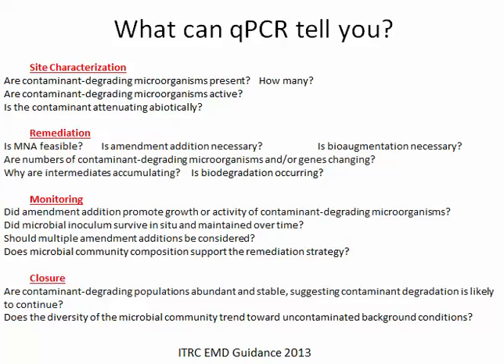Why are contaminant intermediates accumulating? Why is that cis accumulating? Did the amendment promote growth of contaminant degraders? Did the inoculum survive? Is it being maintained? Is the population stable? So these are the types of questions that can be both asked and answered.